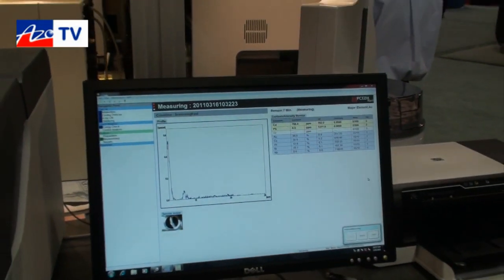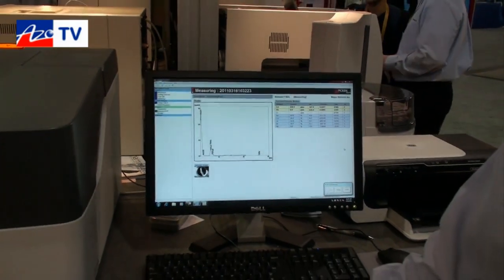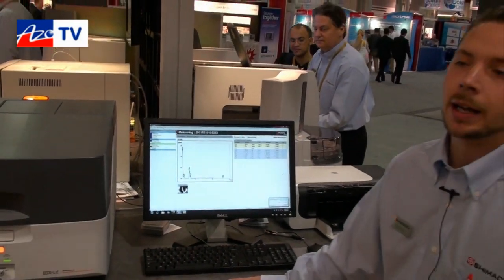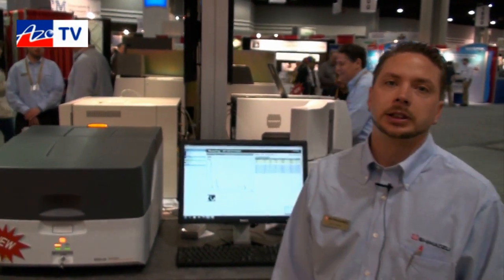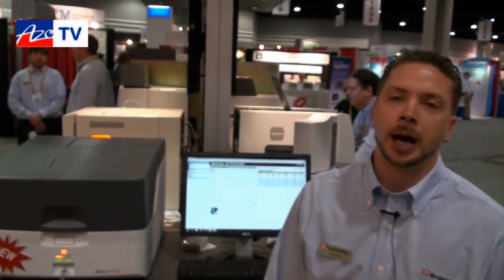This system is suitable for detecting light elements as well? This system is capable of analyzing in the range of aluminum to uranium in solids, liquids, and powders.